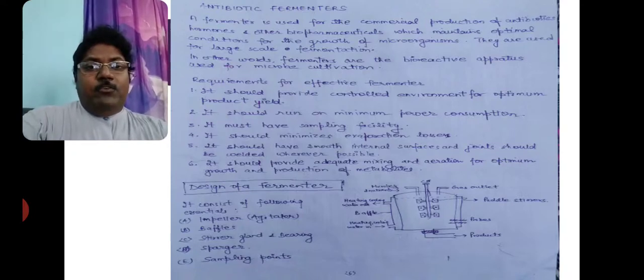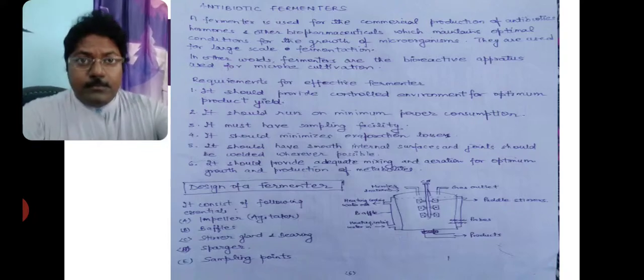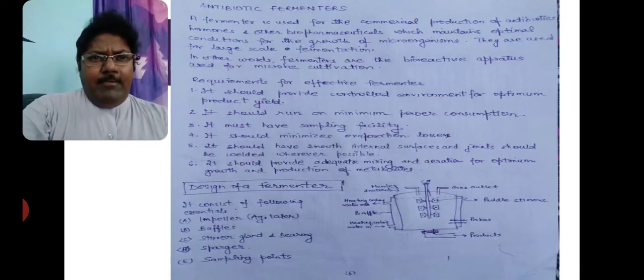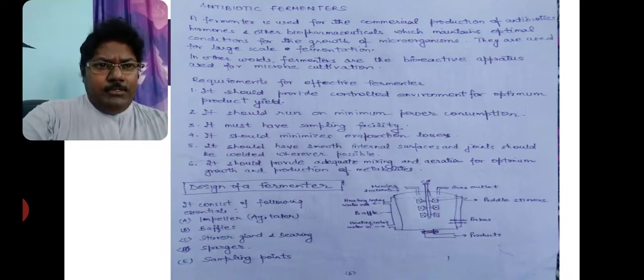It should have smooth internal surfaces and should have welded walls. It should provide adequate mixing and aeration for optimal growth and production of different metabolites.